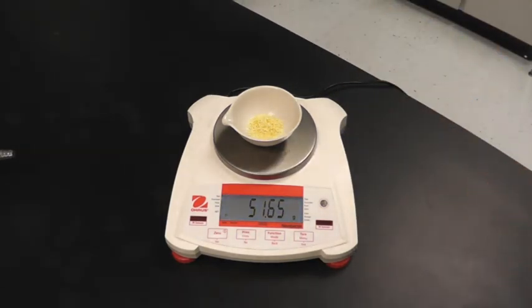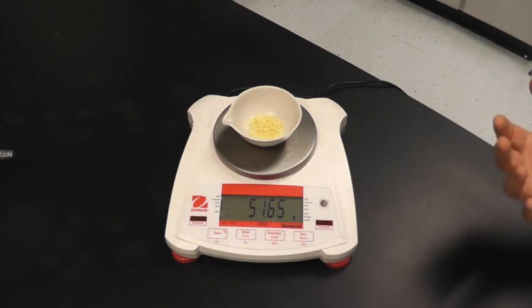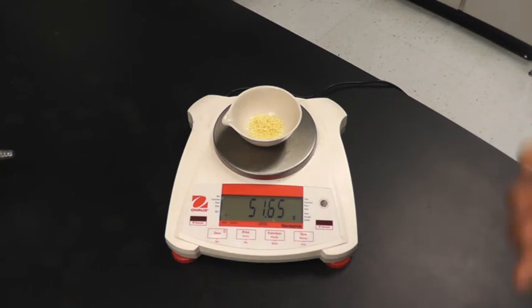What we would typically do in lab is I would reheat this, let it cool, reheat it again. Because we're doing this on video, I'm not going to worry about doing that second for you. But on the Excel spreadsheet, it'll just have the mass after the last heating, okay? So anyways, that is the procedure for the lab, that's what we did to get the numbers in the data table, and that is it. So enjoy doing the write-up of the lab, which is usually the not enjoyable part. But anyways, if you have questions, let me know, but that is the Empirical Formula Lab.